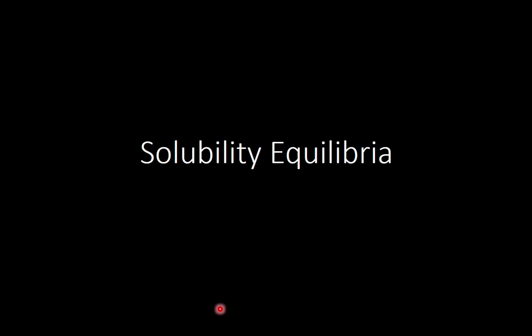This is the background material on the lab called Solubility Equilibria. As this implies, the lab that we're going to be doing today still involves equilibrium, and we're going to be using equilibrium to talk about how soluble a substance is. What's good to know for the lab today is the concepts that it's going to introduce aren't really going to be anything new. You're going to be doing a titration to determine the solubility of something.